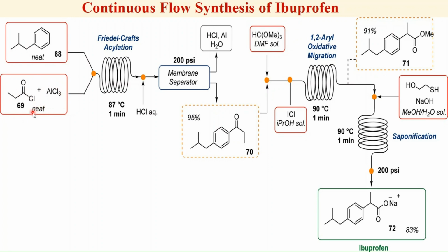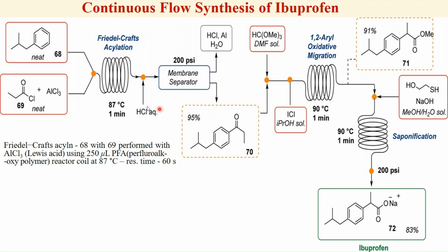All these three were mixed without any solvent and then fed into the perfluoroalkoxy reactor coil of 250 microliter capacity and heated at 87 degrees centigrade for a minute.